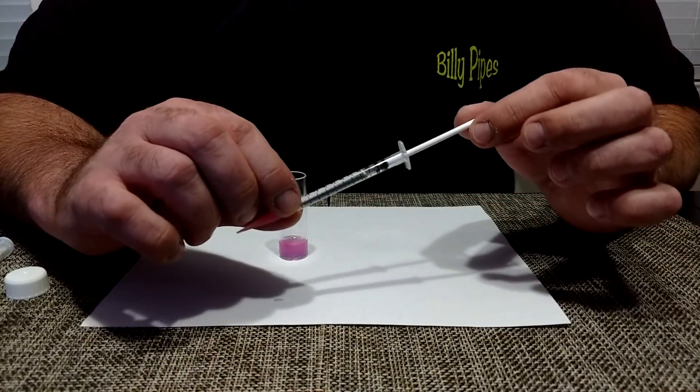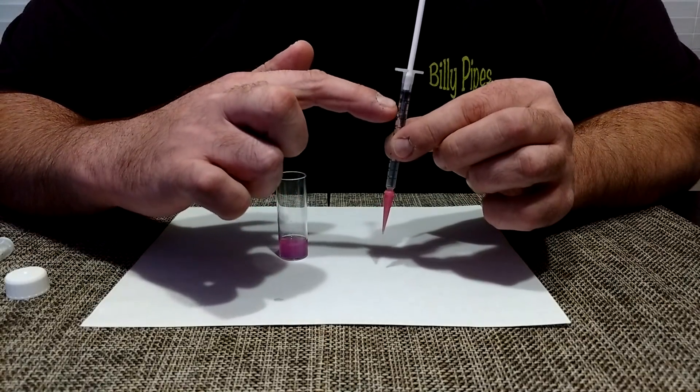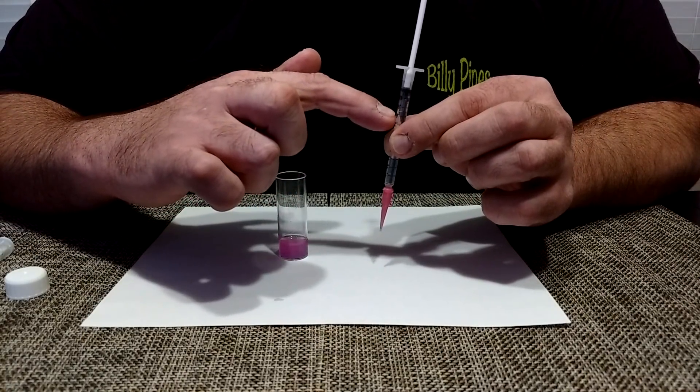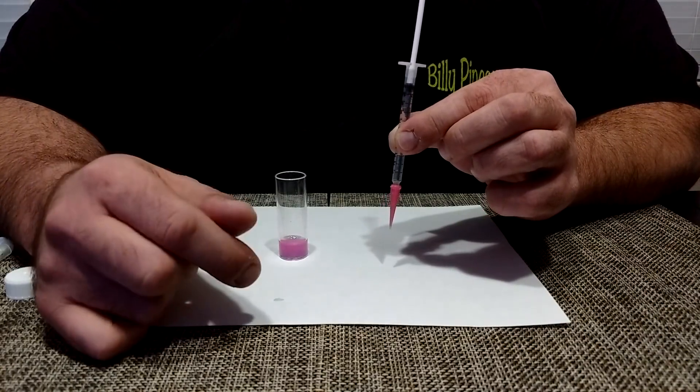And I already pre-filled this. I'll show you the correct way to do it. You want to go with the reading where the plunger is, not where the titration fluid is. So you draw in one milliliter of the titration fluid.